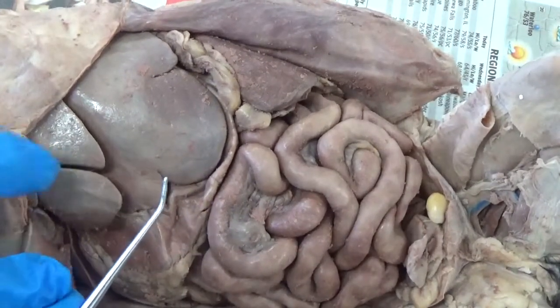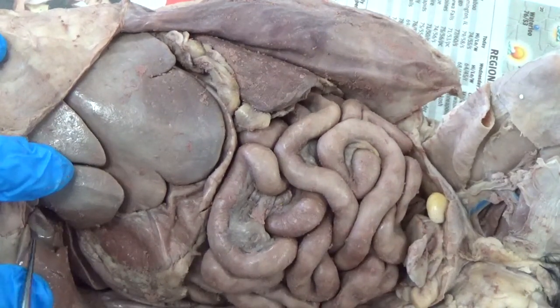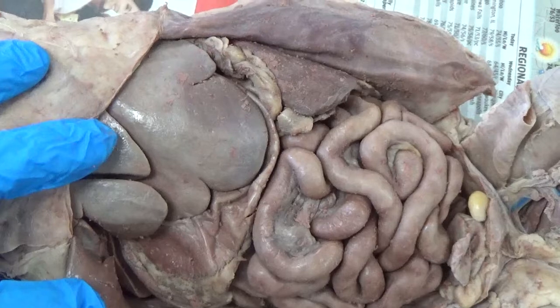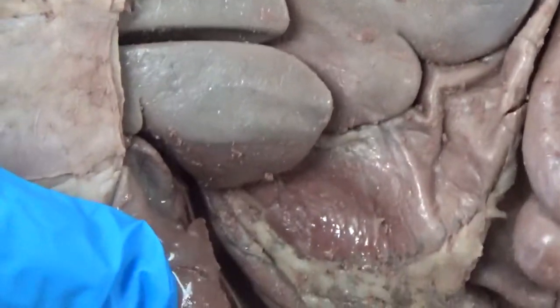If you open up these two lobes right here, you can see there's a little balloon-like structure right here. We'll move it, and we'll zoom in a little bit. Right there, that would be the gallbladder.